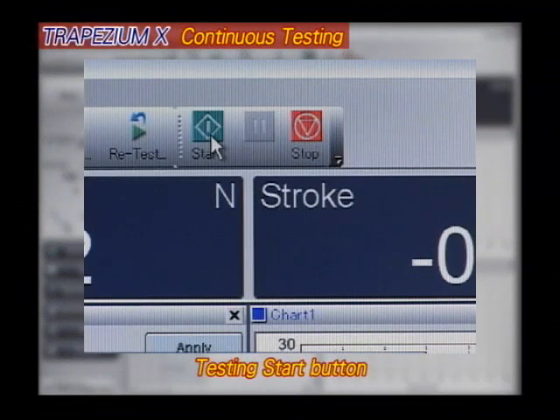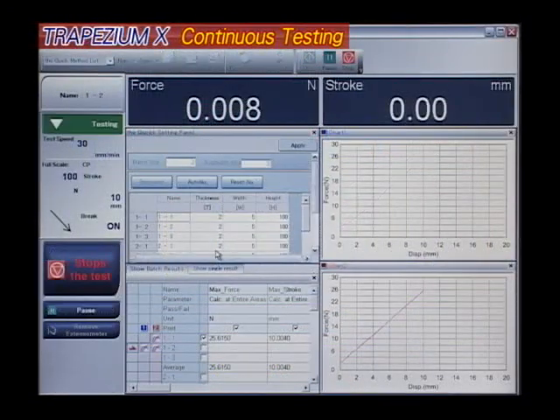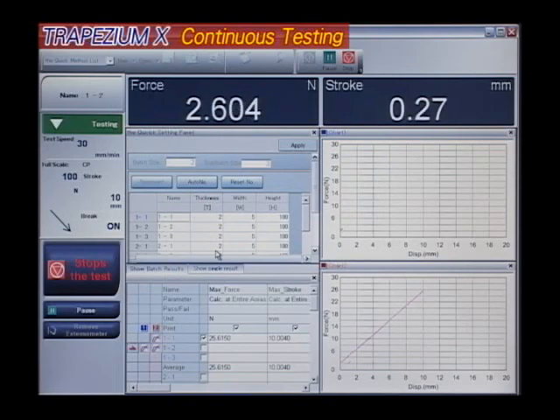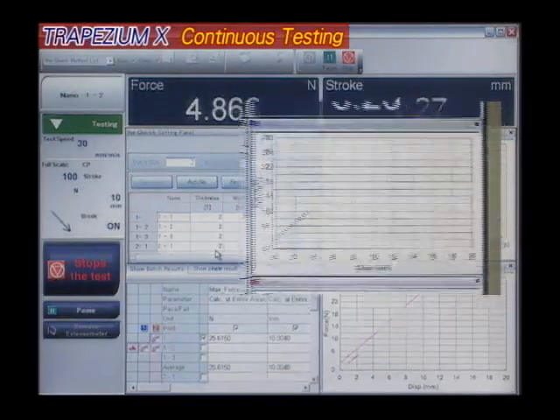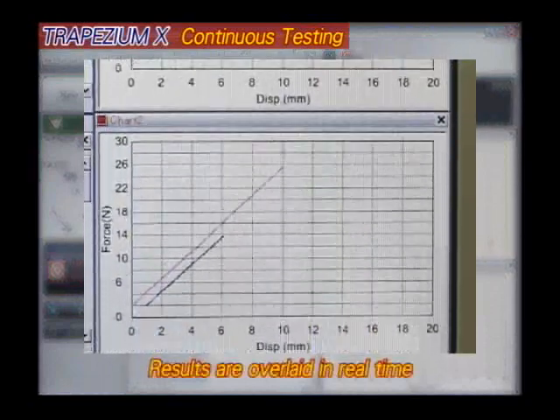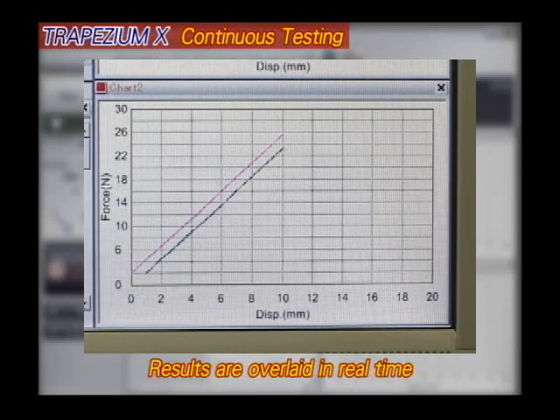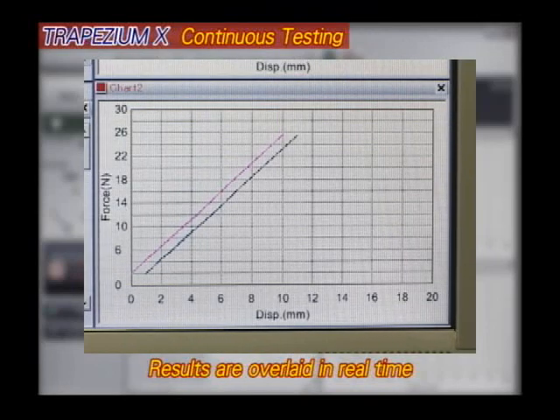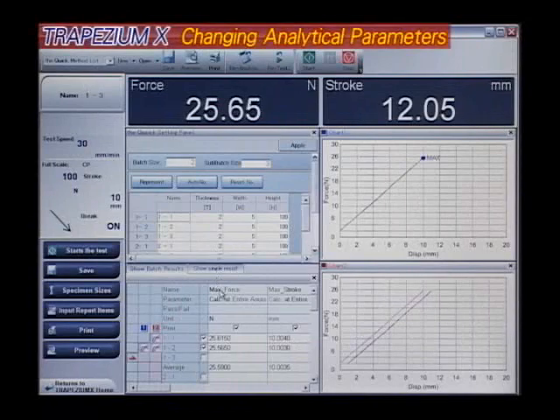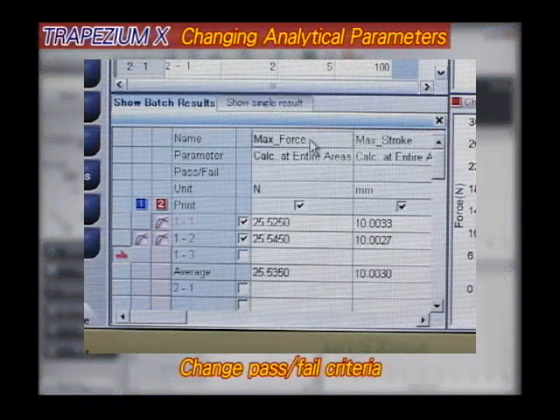When testing is repeated, multiple graphs are updated simultaneously. As you can see, test results are displayed directly using the same window. Analytical parameters and pass-fail criteria can be changed using this window as well.